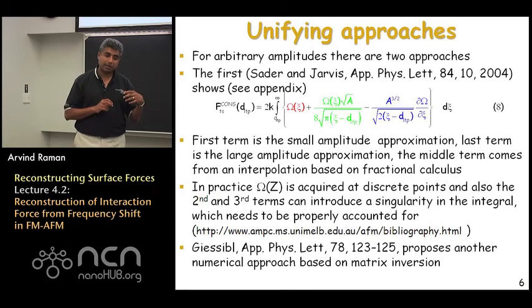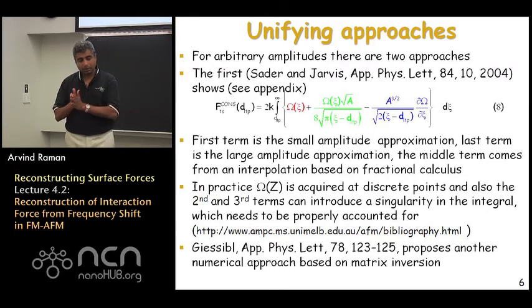So when you're implementing the conversion process, you have to use a discrete form of these integrals, which properly need to account for the singularities. And the reference is shown here where you can look up the process of actually doing so properly. But when properly taken into account, you can get pretty reasonable results out of this method.